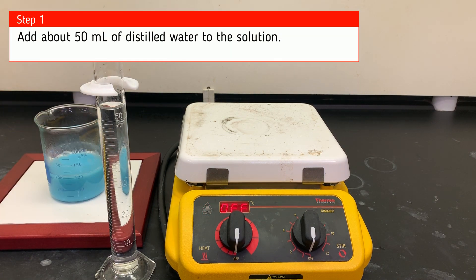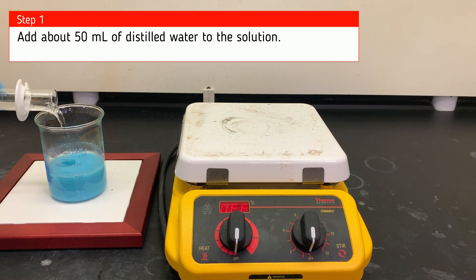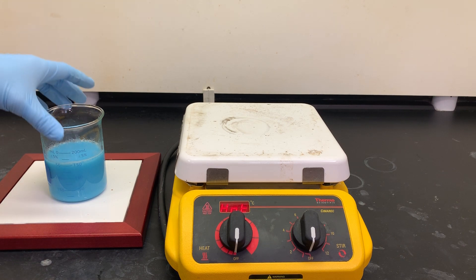Before we heat it, we're going to add about 50 milliliters of distilled water to the solution. When we're heating it we're going to lose some of our water due to evaporation, so we want to recover the loss in advance.